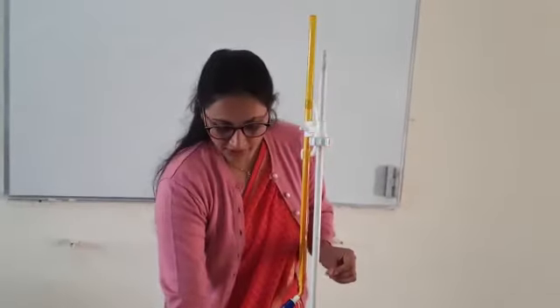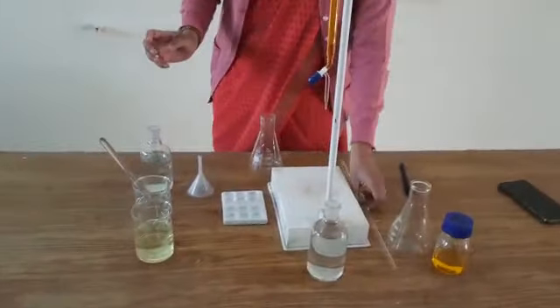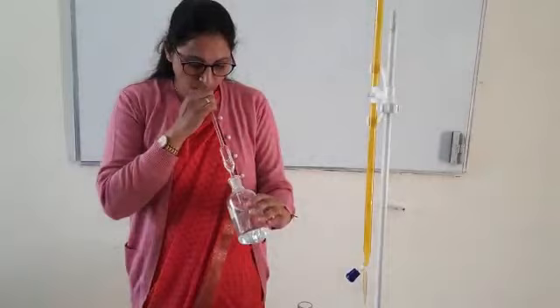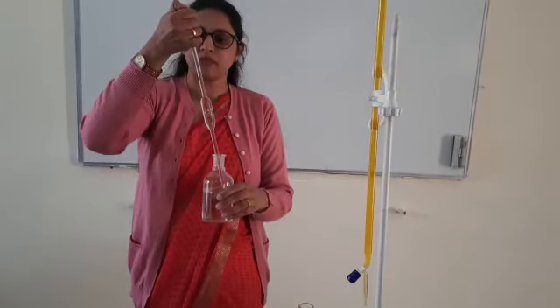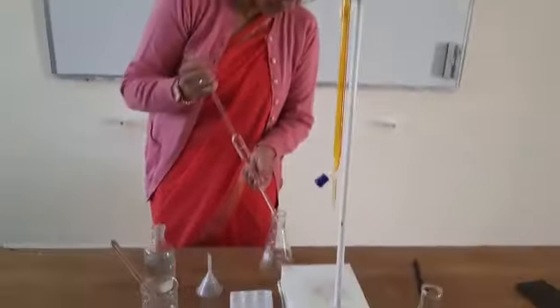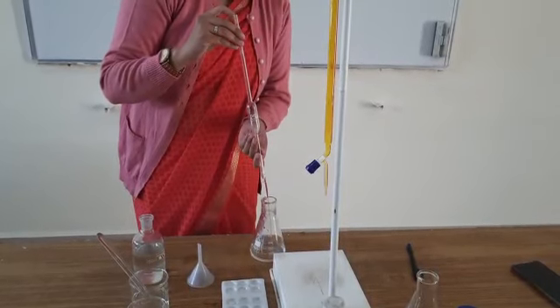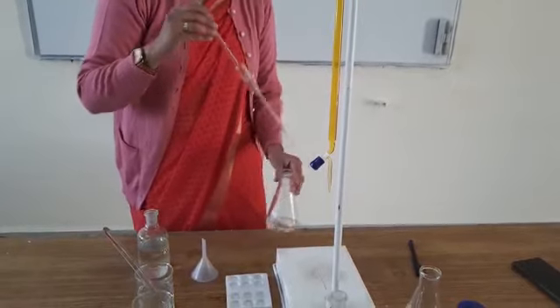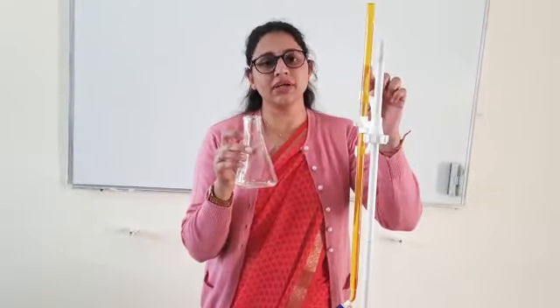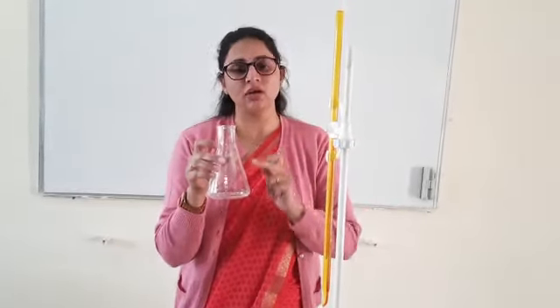In the first titration we will use the known ferrous ammonium sulfate. I will pipette out 25 ml of this solution. This is our 25 ml ferrous ammonium sulfate — this is the reaction mixture. I have taken the known ferrous ammonium sulfate to standardize the potassium dichromate first. After standardizing the potassium dichromate, we will repeat the same practical for the unknown ferrous ammonium sulfate.